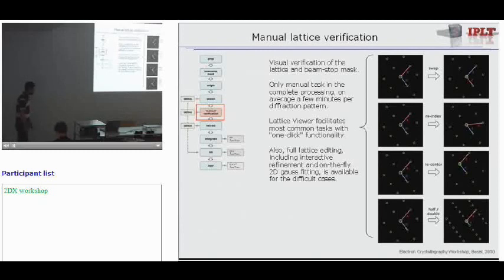What is also quite handy sometimes is if there are some symmetries or some crystals where not all of your diffraction spots are very strong. It might be that the closest diffraction spots to the center are very weak, so the automatic lattice determination picks up a peak which is a little bit further out, at twice the distance or something like that. This can happen. So it's easily done to just take half the length of one of the lattice vectors to index that.